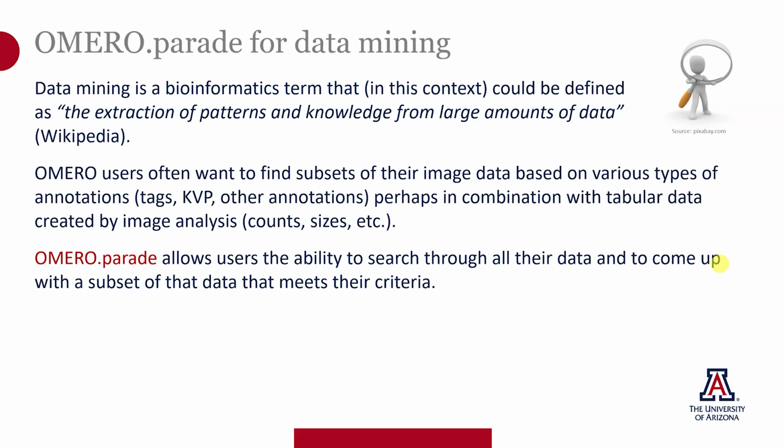There's a really good video about using OMERO Parade that came out of the August 2023 workshop that we held here at the U of A. We encourage you to look at that for more detail on finding subsets of data. The trainers were able to do things that I don't even know how to do.